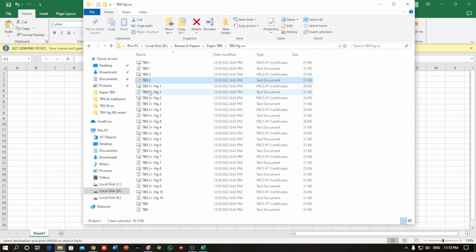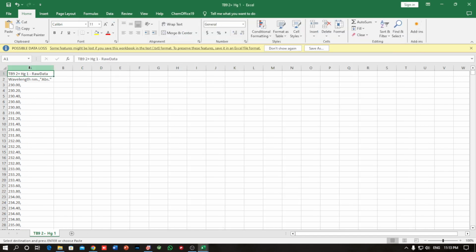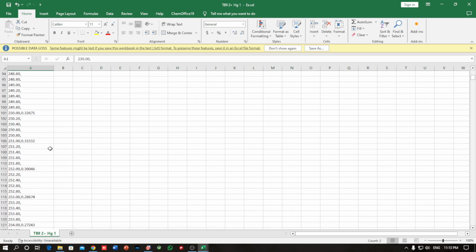So what is the process? Now again, go to this file in Excel, same thing. Click on the A value so that the A column will be expanded. Now delete this value and then go to the point where the y value started. Here at 250 the y value started. So just in its nearest column, that is B, press equal to RIGHT.